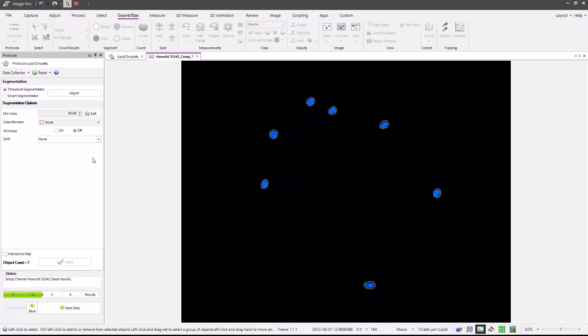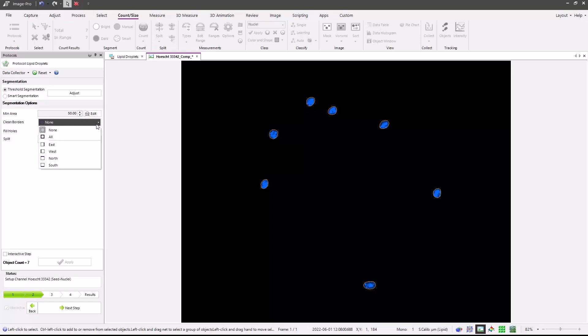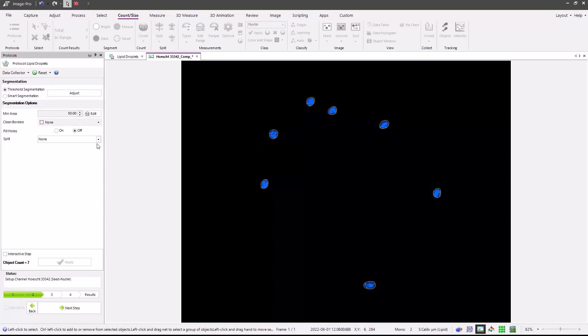This step includes segmentation options, where we may filter out non-specific fluorescence or cells using the minimum area button. Clean borders with choices for all and the various sides of the image frame. Fill holes. These nuclei are well-segmented, so we don't need to fill many gaps. And since the nuclei are also well-separated, I'm not going to use any object splitting. However, you can also use watershed or boundary shape if appropriate.